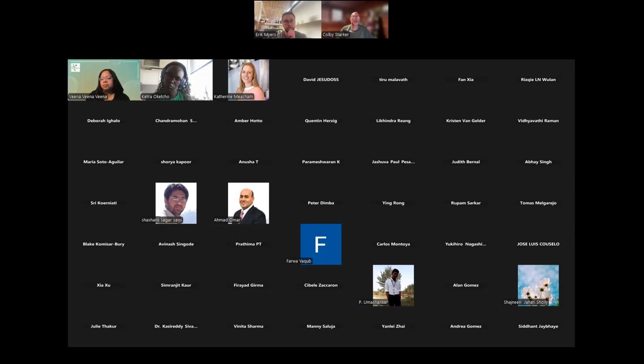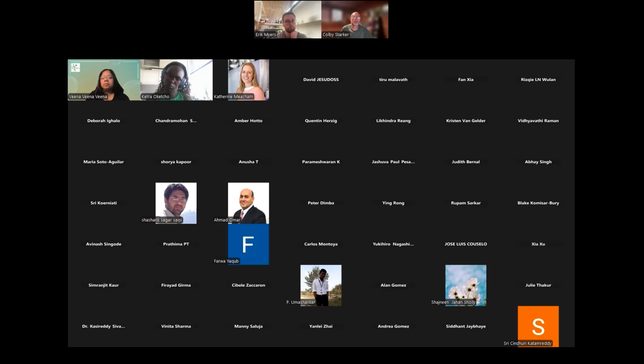So we exclusively use the U6 promoters, and we've had very good success having many copies of the U6 promoter to drive individual guide RNAs. We only drive one guide per U6. I've personally done 24 different guides on a construct and had pretty good success. I know we've done in tomato something like 16 guides, all driven by an individual U6 promoter, and that works really well.